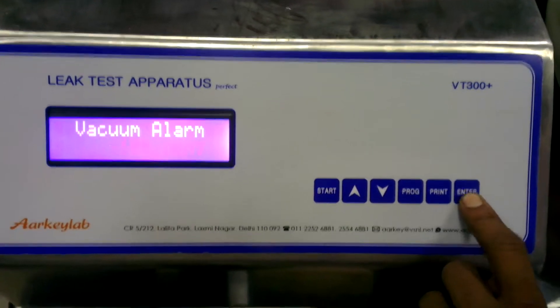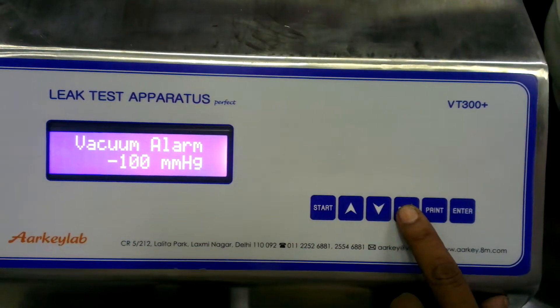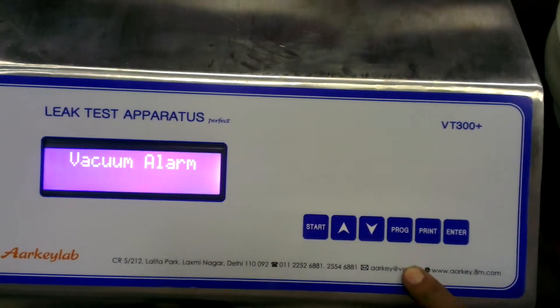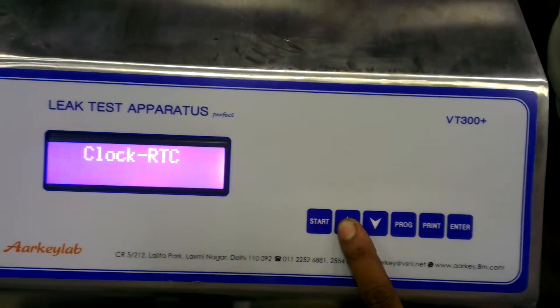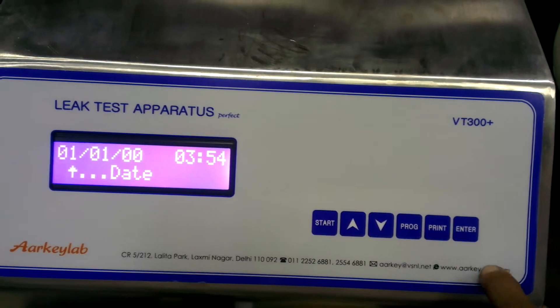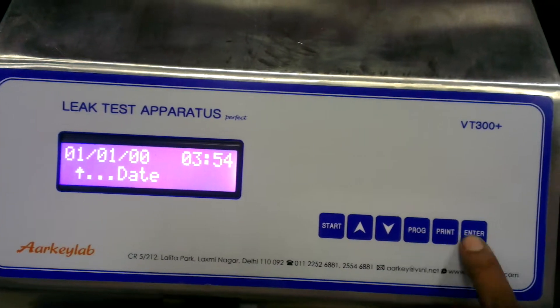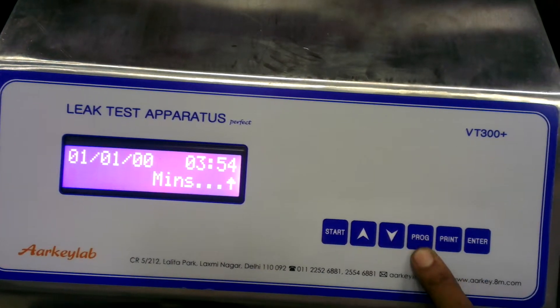Now set the vacuum alarm — set 100 as default, press Enter, then press Program. You can set the RTC clock using the Up and Down keys, then press Enter and Program.